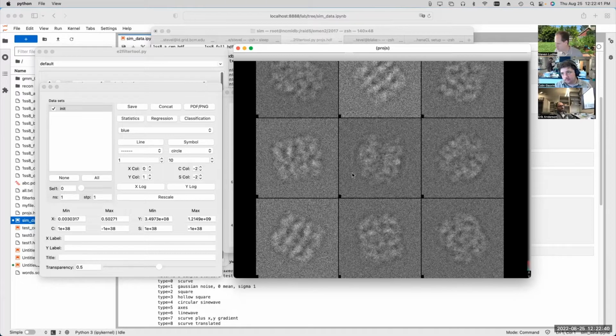So it's sort of like the actual high resolution structure of the protein is absolutely fine, but then there's this sort of step function as you go from the vacuum up to the protein. And by not solvating it correctly, you cause all sorts of additional problems, in the sense that it makes the reconstructions a lot easier than they are in actual cryo-EM data. So even though visibly you can produce something which looks a lot like cryo-EM data, there are some real mathematical outliers, problems with the data from that perspective.